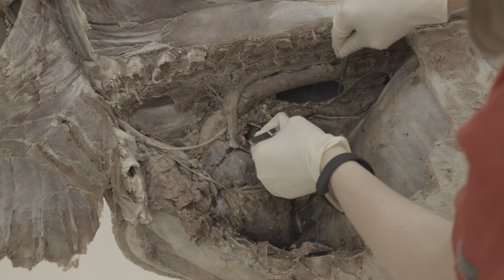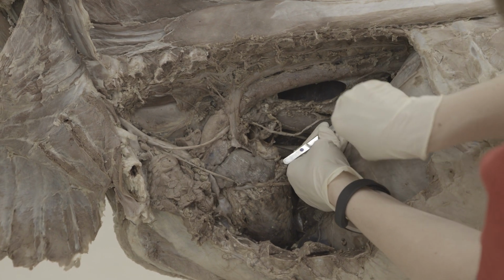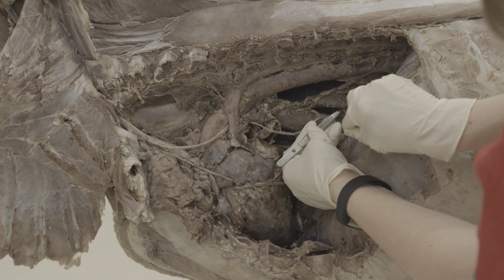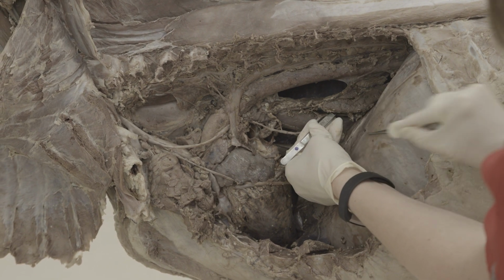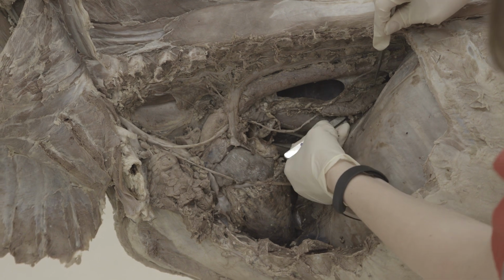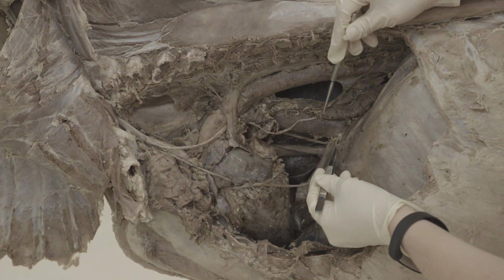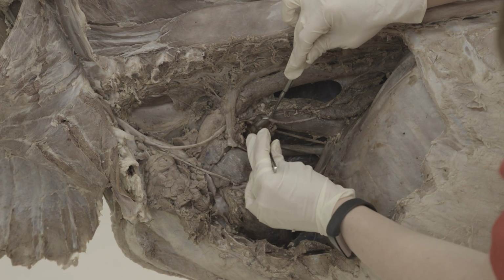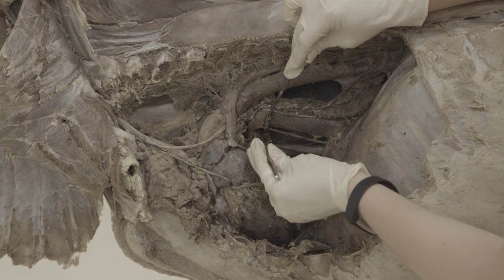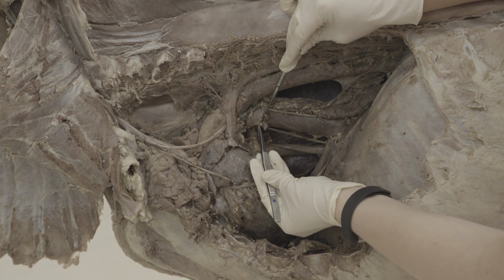So that brings us to this huge lymph node that you see here. All of this is caudal mediastinal lymph node, or lymph nodes because there's a couple of them, but caudal mediastinal in the calf is very, very large. You can also look for the tracheobronchial lymph nodes, but sometimes they're a little hard to see. It looks like we have one here that we had to work around for the nerve. So, tracheobronchial lymph node there.